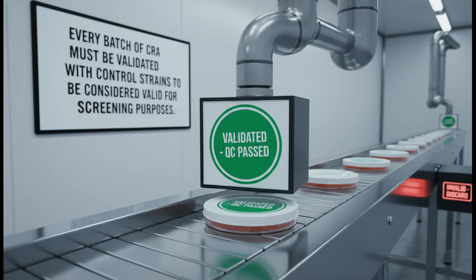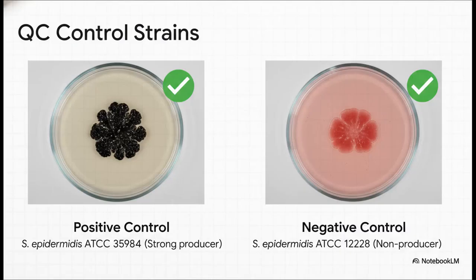Now let me be crystal clear. The CRA test is being phased out for diagnostic work. If you see it used for a research project, fine. But from a quality control perspective, there is a new mandate. Controls are not optional. Any CRA plate run in this lab for any reason must have proper controls on it. No excuses, no exceptions. And these are the only acceptable control strains.